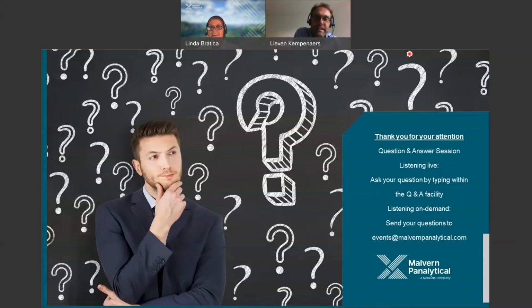That depends on the application, because as I mentioned before, with a WD-XRF, the power is always much higher than with ED-XRF. So that means you heat up your sample, you burn your sample with X-rays, and the crystal structure starts to change. We also double-checked that with XRD spectra. So WD-XRF is not always the best choice for the pharmaceutical industry, especially when you have the heavy elements. The sensitivity of the heavy elements is better with ED-XRF.